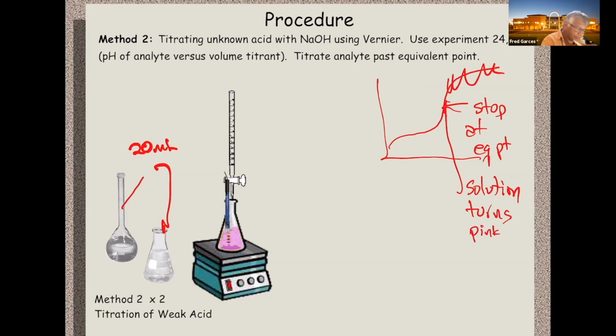Okay, so you stop. Now, you're going to pick phenolphthalein indicator. And phenolphthalein indicator is a good indicator because the equivalence point is going to be above 7, between 8 and about 10, and that's where phenolphthalein changes color. You don't want to use an indicator like methyl red, because methyl red changes between 4 and about 5 pH. And so you would be prematurely calling the equivalent volume before you reach the equivalent point. So we're using phenolphthalein indicator, turns pink. We stop once it turns pink, okay?